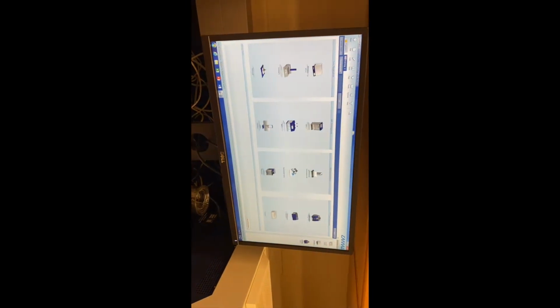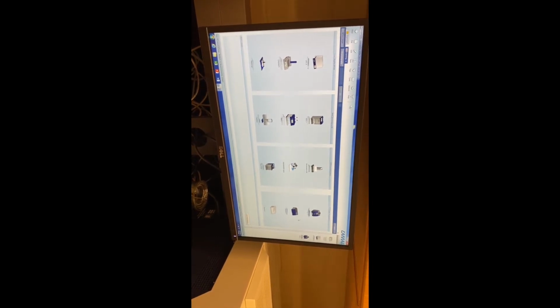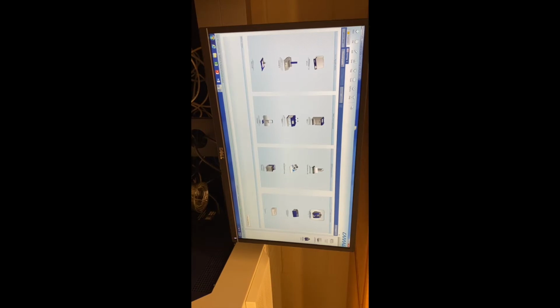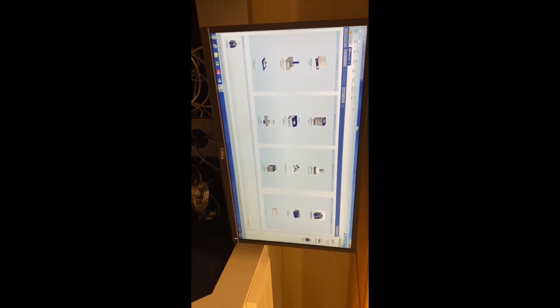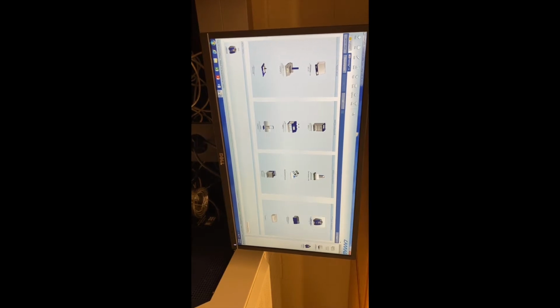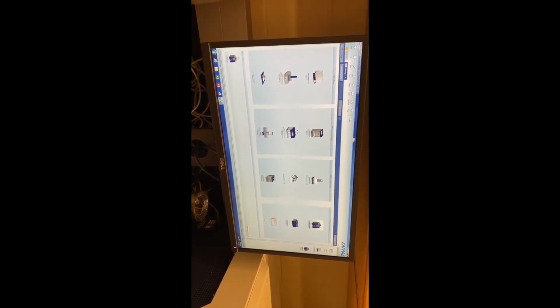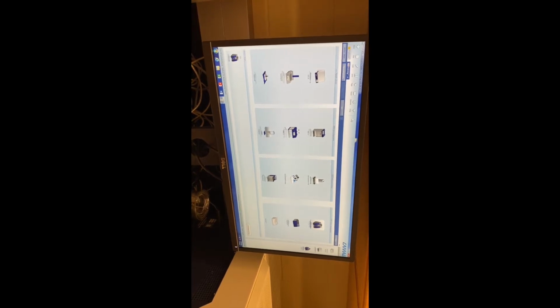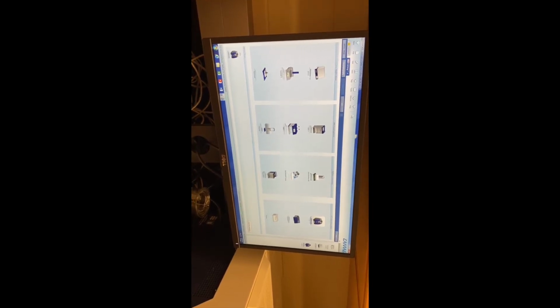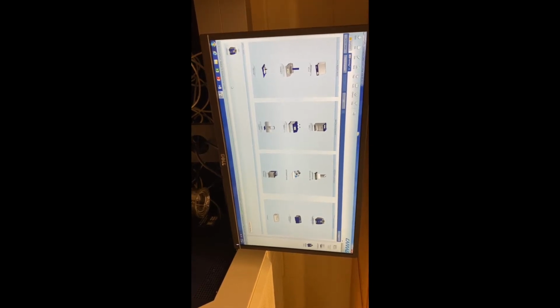So right here we can choose the order of the process, how we want to do it. So we will always do a visualizer first. You just need to click it, you don't need to drag it down here. So this visualizer can take pictures of the clean plate, and then when you are taking the pictures after you derivatized the plate, it will automatically subtract the clean plate, the background.